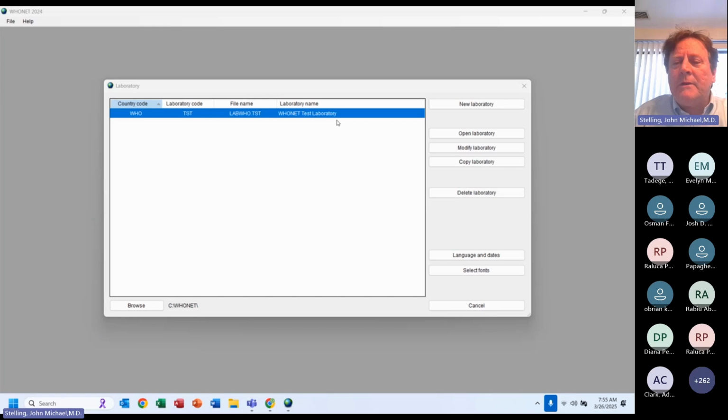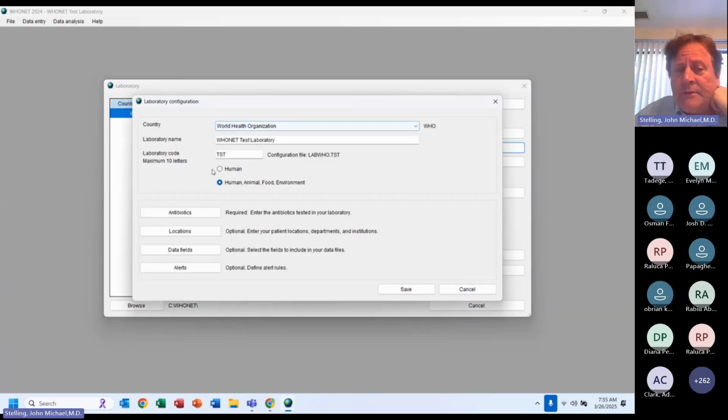Okay. So on the previous presentation webinar, we talked about new laboratory, open, modify laboratory. So let me go to modify laboratory for just a little bit. Modify laboratory. I can choose the country name, human, animal, food. I choose the antibiotics, the sample collection locations. Those could be human clinics and wards. Those could be animal clinics, farms, markets, wild animals.